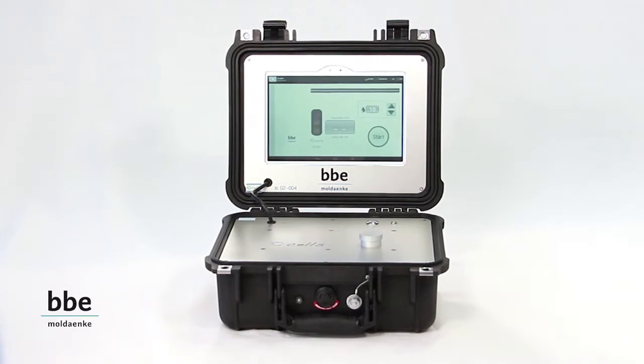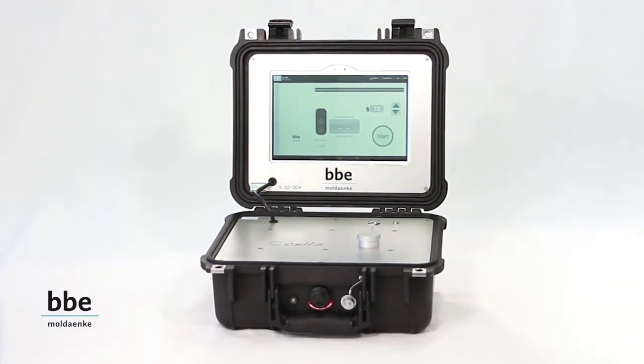Our newest development is the TenCells. The easiest, fastest and most precise device for indicative testing of ballast water.